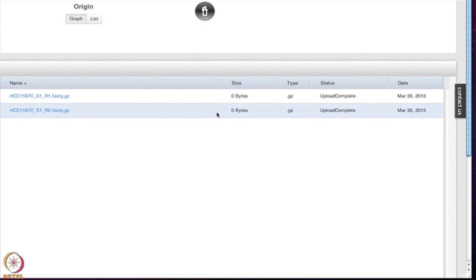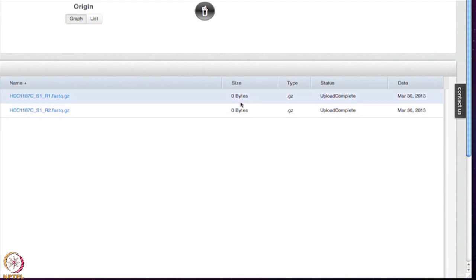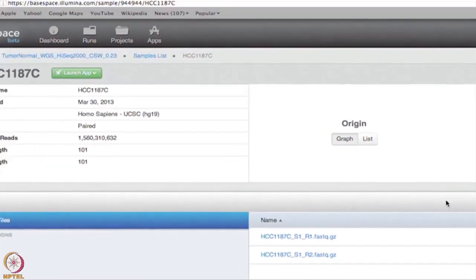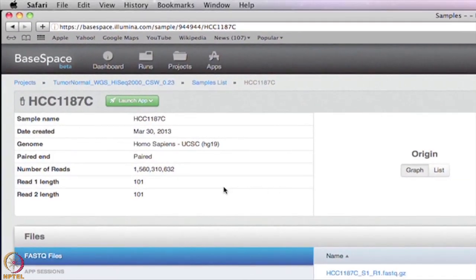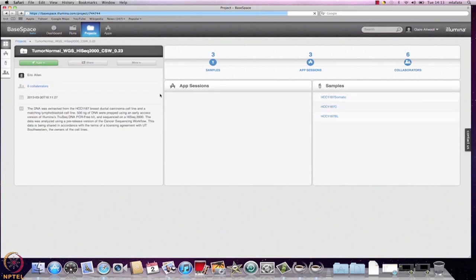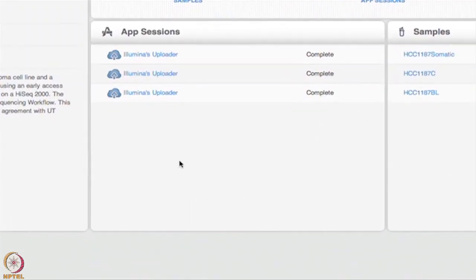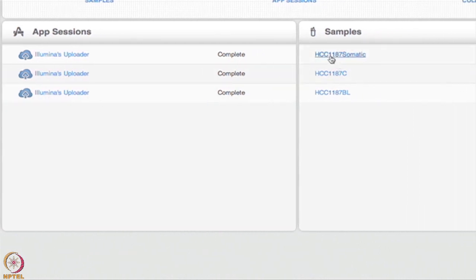Inside the sample hyperlinks, you will find FASTQ files. These will usually be full FASTQ files, but in this case, empty FASTQ files were uploaded as placeholders. You will also find information about the samples, including the read length, the total number of reads, and whether this was a single read or paired-end run. Inside the app sessions, there is a folder for each analysis performed. Here they are named Illumina's Uploader, as they were uploaded directly by Illumina. The naming convention should be more informative in the future, but the sample names correspond to the app sessions, so you can use them as a guide.